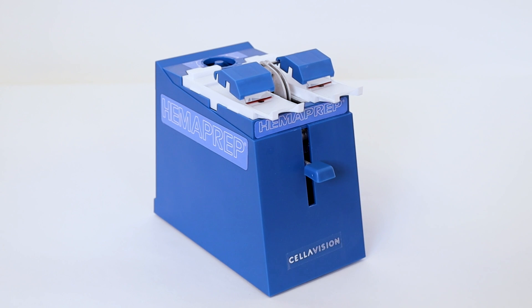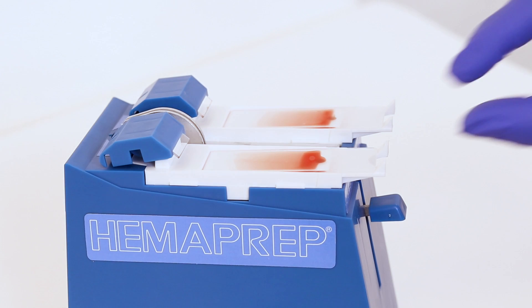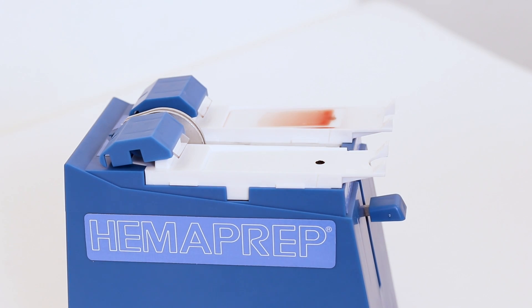If you hold it too long, blood will wick on the opposite side of the spreader blade and too much blood will be taken down the slide, which gives a suboptimal monolayer. Remove the slides and let them dry completely before staining.